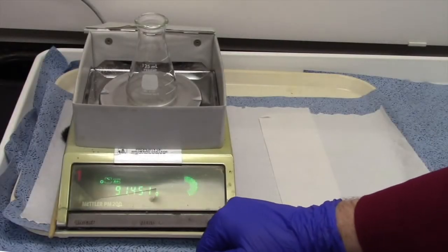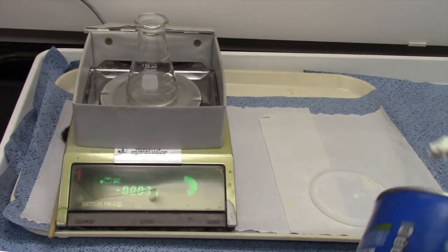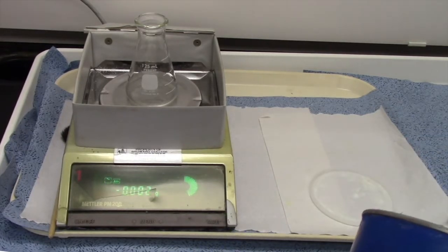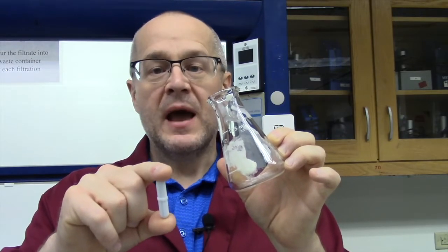We're going to weigh out 2.5 grams of this vegetable shortening, directly into this Erlenmeyer flask. This white bar is a Teflon-coated magnet, and we have a stirring hot plate causing it to stir the reactions.